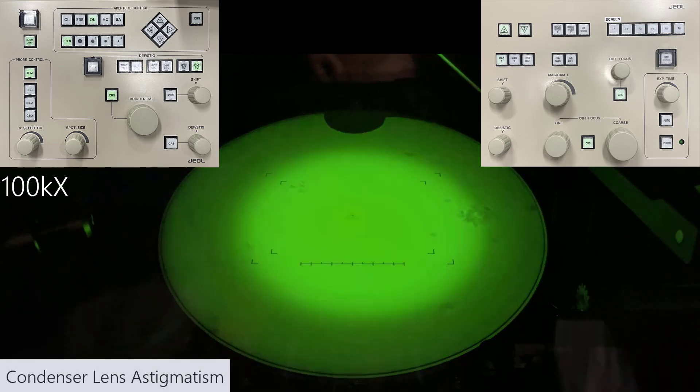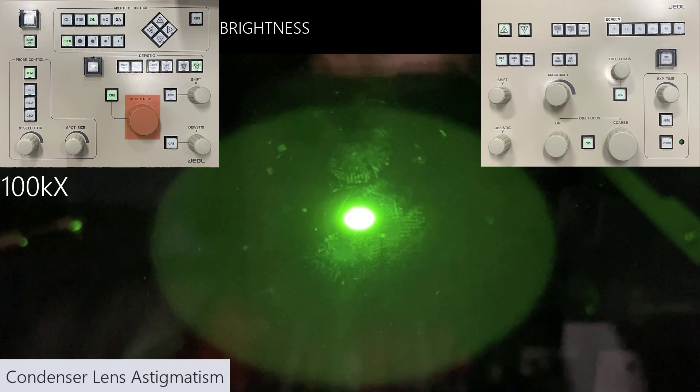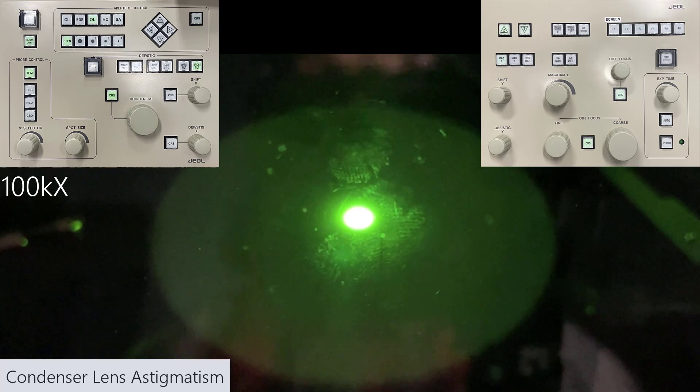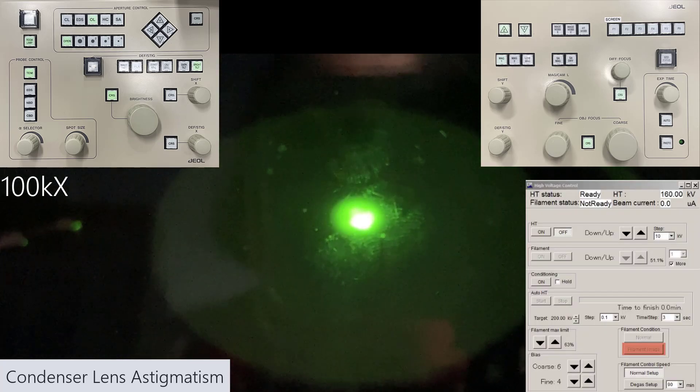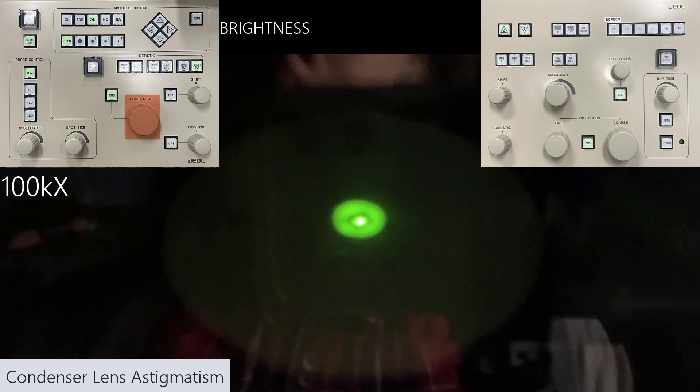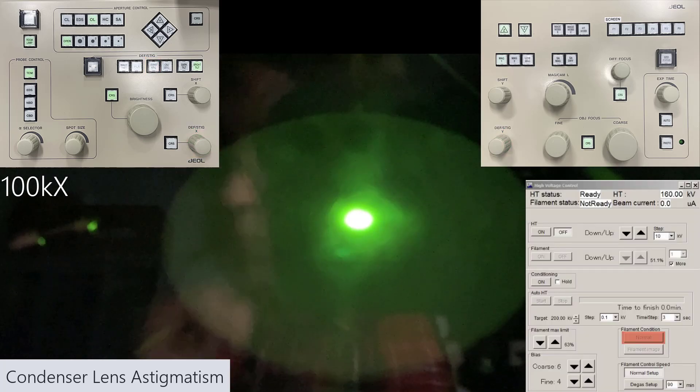Next is the condenser lens astigmatism, which is useful if you plan on doing high-resolution imaging. Condense your beam, and drop the current so that you can see the tip of the lanthanum hexaboride crystal. Select the filament image button — in some cases you may need to manually decrease the filament to see the tip. Fine-tune the focus of the filament image using the brightness knob, and you may need to deselect the coarse button. Then select the condenser stig button and use the deflector stigmator X and Y knobs one at a time to sharpen the image as much as possible.